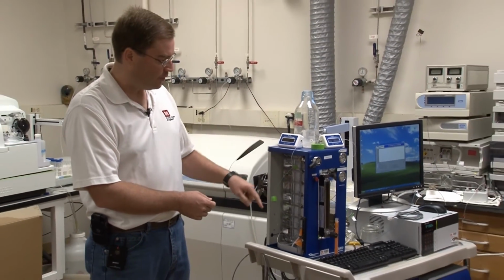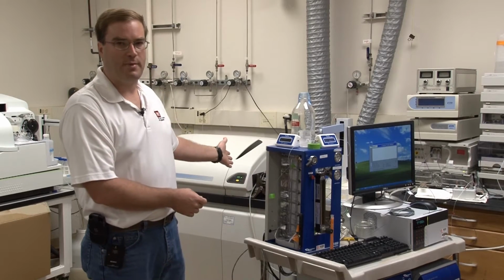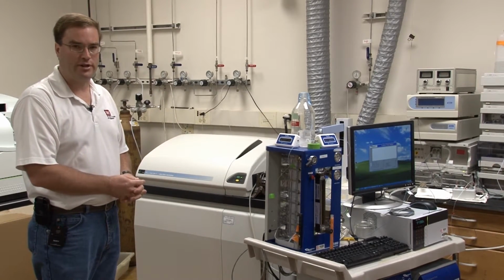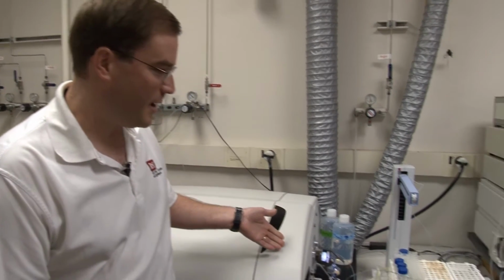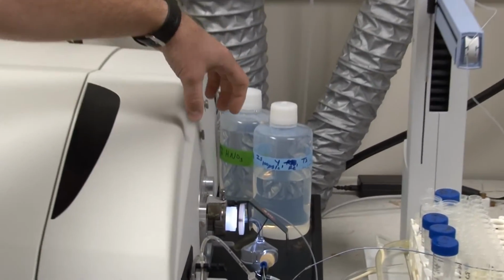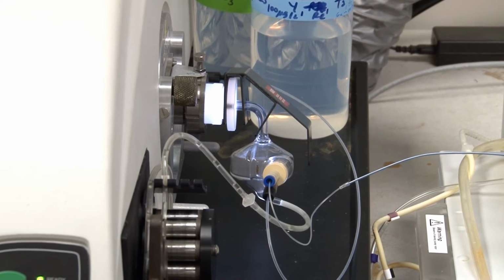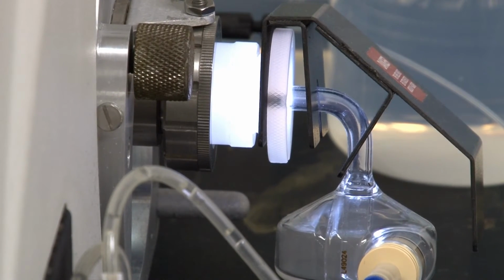We then take the effluent from the channel and send it to the ICP-MS, which provides elemental specific detection at the part per billion concentration range. The first detector we use is a UV absorbance detector, primarily for organic compounds as well as the polystyrene size calibration standards. The second detector is the ICP-MS. This is where a 7,000 degree plasma takes the particles and ablates them into ions. The rest of the instrument determines the mass of those ions, where we can do multiple elements simultaneously.